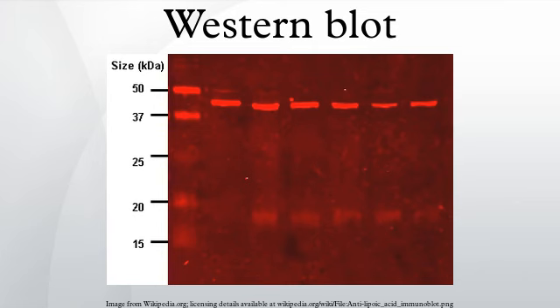Colorimetric detection: the colorimetric detection method depends on incubation of the Western blot with a substrate that reacts with the reporter enzyme that is bound to the secondary antibody. This converts the soluble dye into an insoluble form of a different color that precipitates next to the enzyme and thereby stains the membrane. Development of the blot is then stopped by washing away the soluble dye. Protein levels are evaluated through densitometry or spectrophotometry.